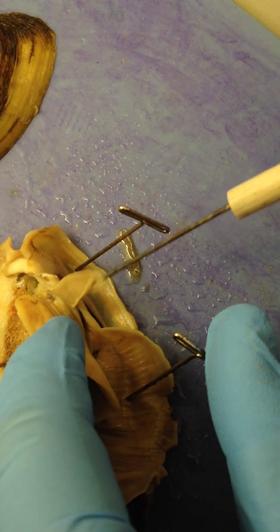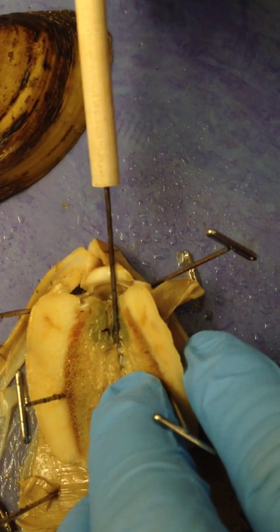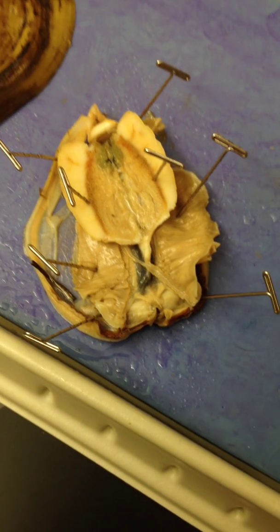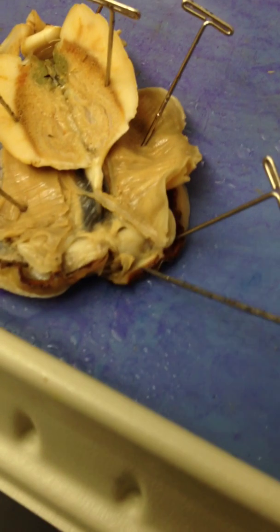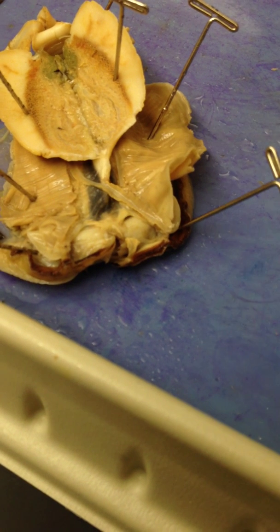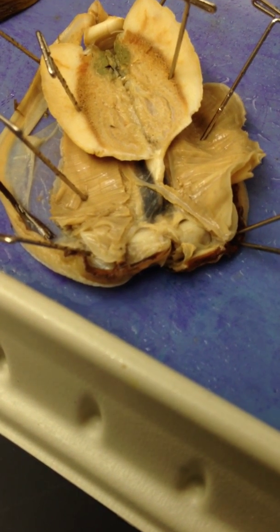This is the labial palp. This right here is the mouth. If you were to close it, you can see where this piece here would line up with this piece here — that would be your excurrent canal, and the anus empties into that. This piece here would line up with this piece here — that's your incurrent canal.